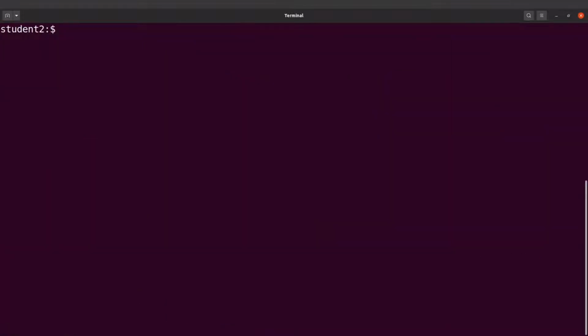Now with the current setup we can use spades.py like this, alright. But then if you open a new terminal, you will not be able to do that. This is because the export command we used here will only work in this particular session.